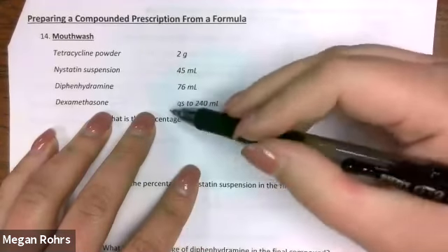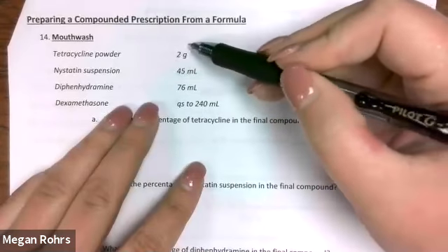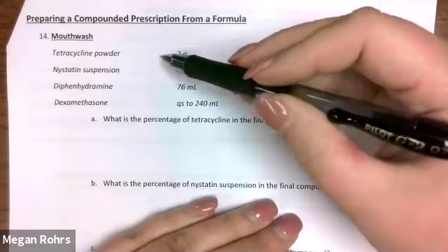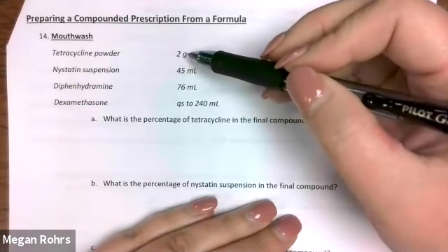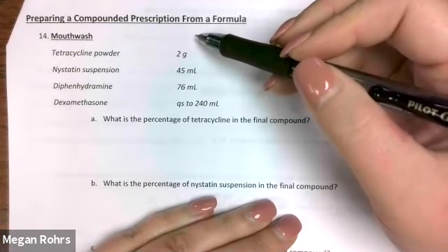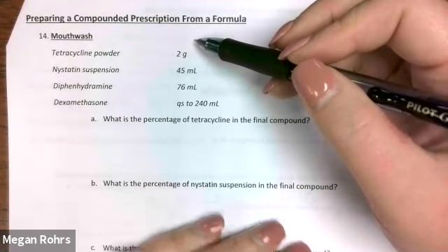The reason is that our tetracycline powder is measured in a weight measurement. When that powder is dissolved, it's going to take up volume of its own, and we cannot determine exactly how much volume that will be.